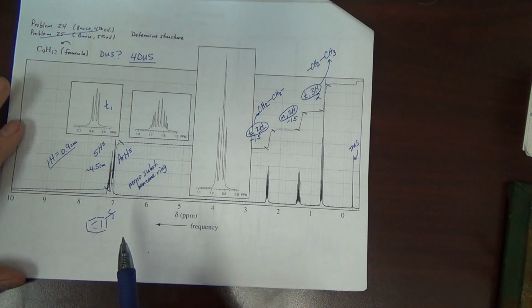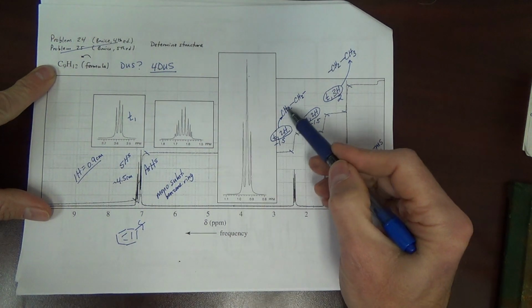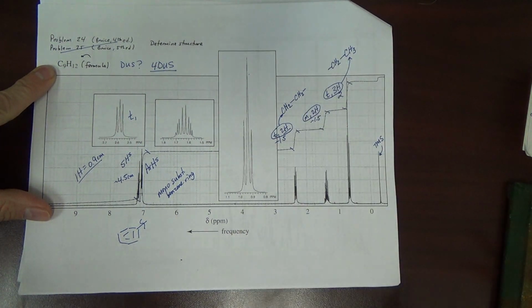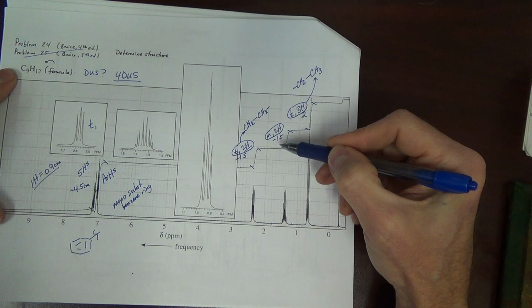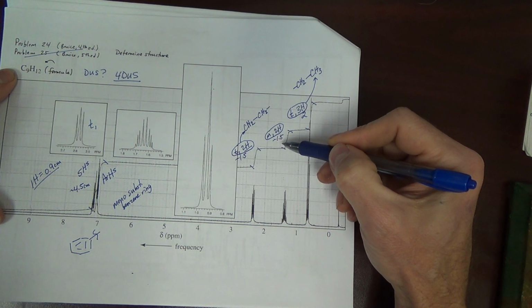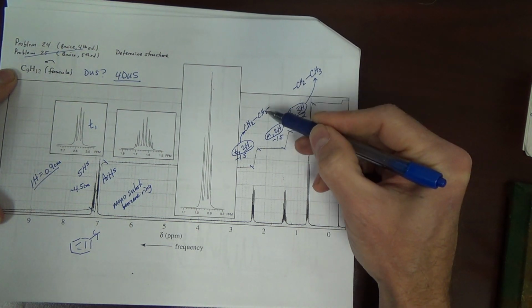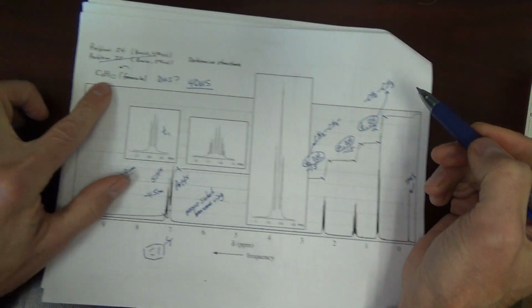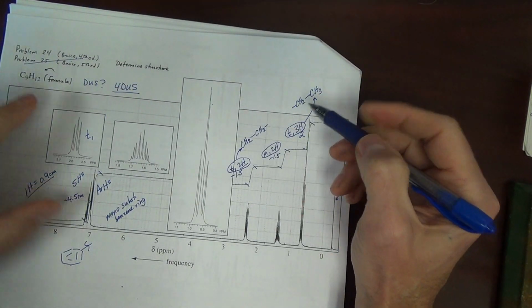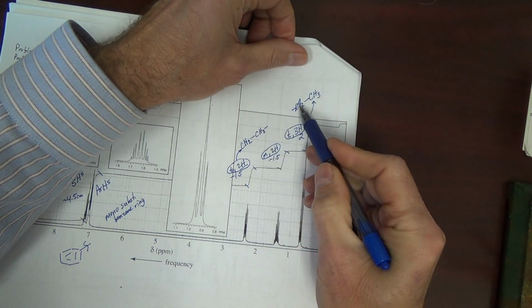But hold on a minute. This compound has 9 carbons. We've shown 6, 7, 8, 9, 10 on the page. We have too many. We also only have one other signal, this multiplet 2H. It's a CH2. It's one of these. But actually these two, we have too many carbons. We have to get rid of one of the carbons. Let's get rid of one of these and make this CH2 the same as that.